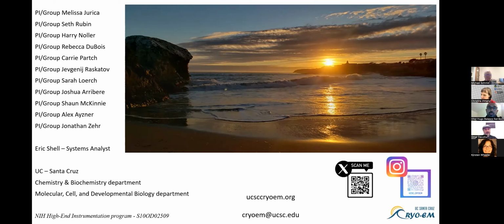We changed it a little bit because the Falcon 4i produces EER, so you collect like 320 frames per second. You can pretty much smooth your dose across a lot of frames. It is very helpful when you try to avoid these small movements, because at the end we have to average a lot.